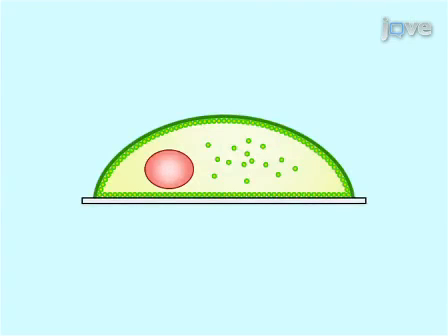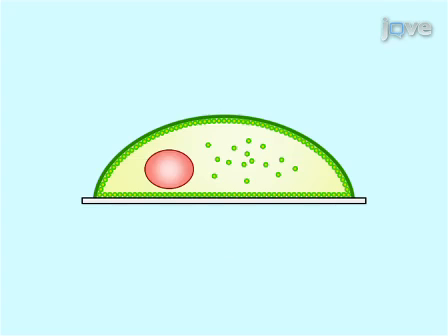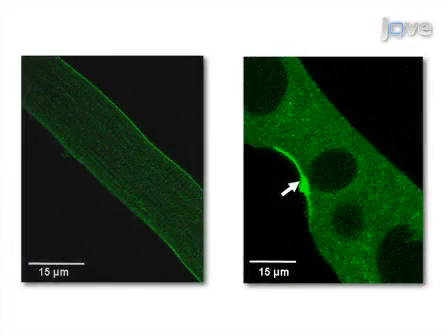Isolated cells are transfected with plasmid DNA expressing GFP MG53, which will localize to the plasma membrane and cytosol of the cell. The tip of a microelectrode is then inserted into the C2-C12 membrane to induce damage. Ultimately, results can be obtained that show translocation of the GFP MG53 to the injury site.